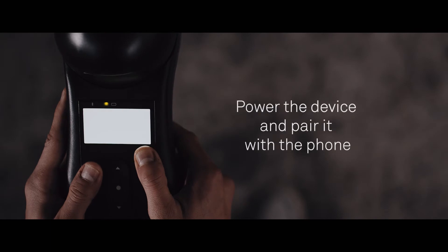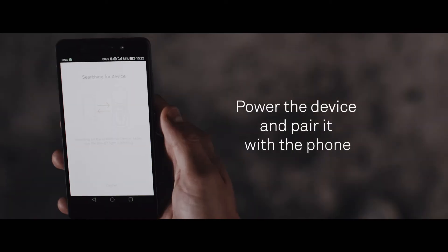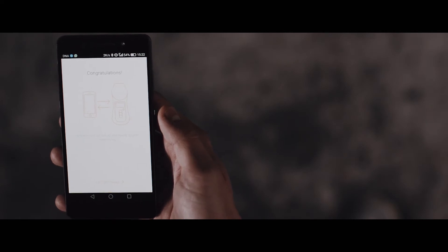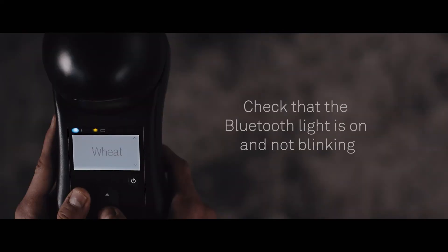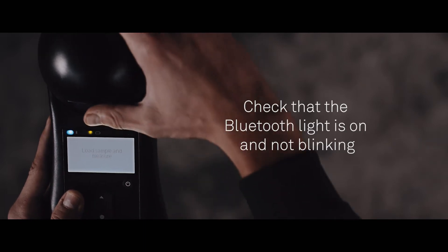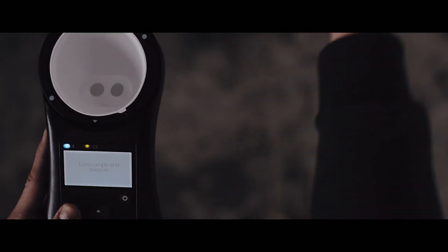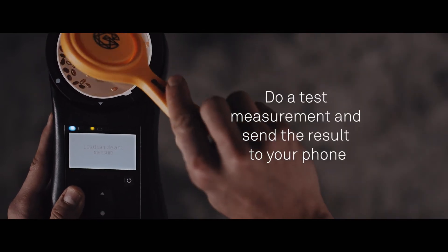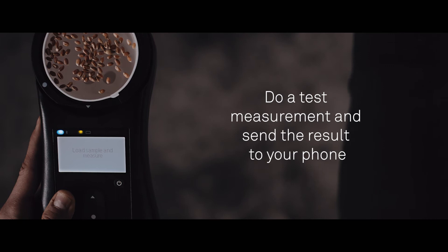Power the device and pair it with the phone. Check that the Bluetooth light is on and not blinking. Do a test measurement and send the result to your phone.